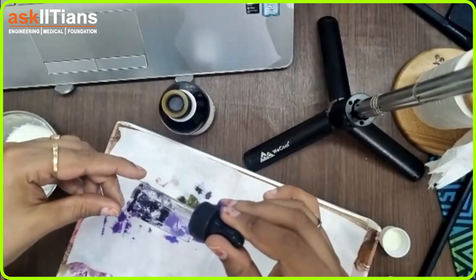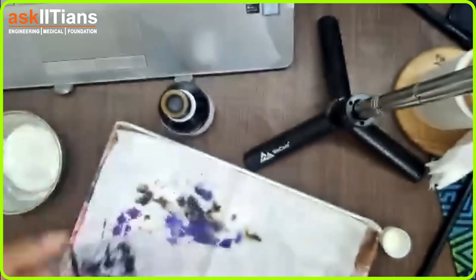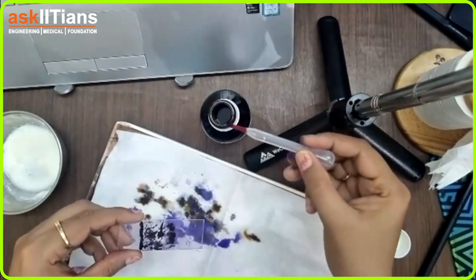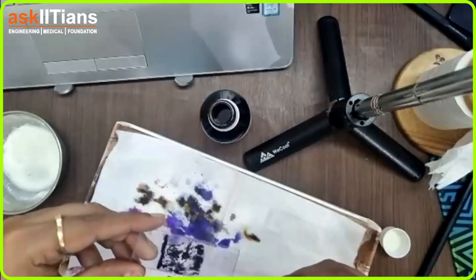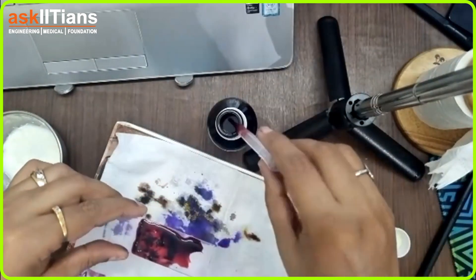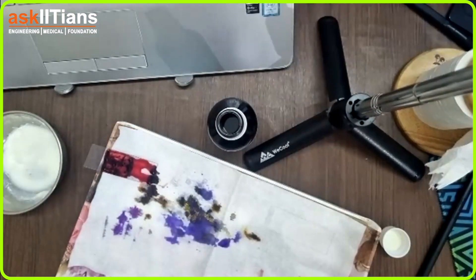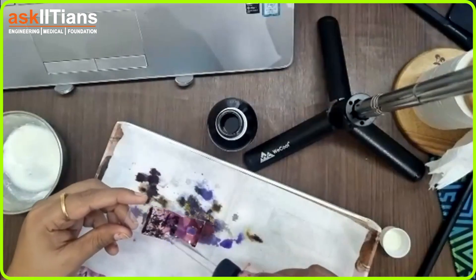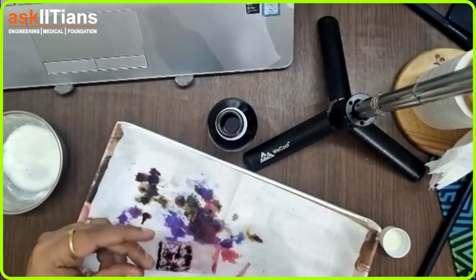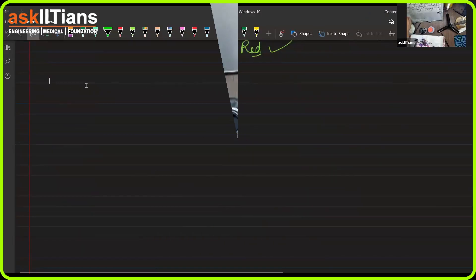Now I'm going to wash it with water again. For the last step, I am taking the safranin dye and putting it over the slide. Let it rest for 30 seconds. Now excess chemical will be out — we will simply put water over it.